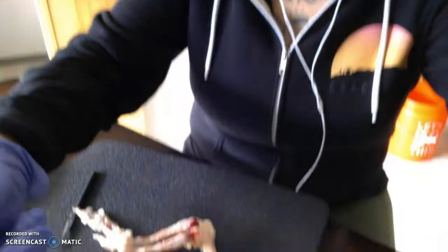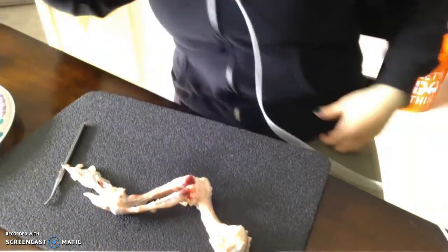Hi, my name is Gabby and today we're going to be doing our chicken dissection. So we're going to begin with doing the anatomy, showing the major structures that we want to talk about, and then follow up with some diseases that can be seen.